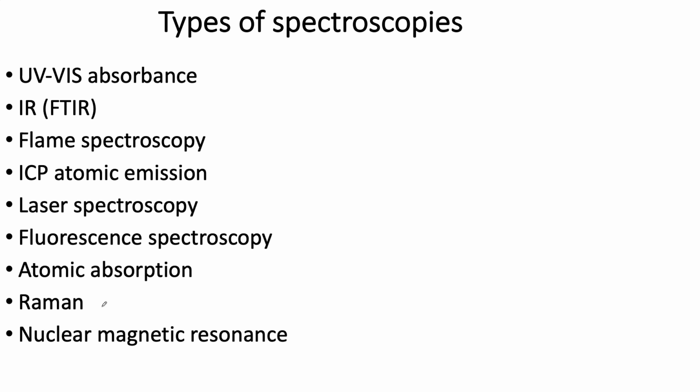There's another one called Raman spectroscopy. In this case, you use a laser. It's almost always an argon ion laser. So you send in light, and you're not looking for that argon ion laser light to come out, because most of the light that comes back out is the same wavelength as the light you put in. Most of it just scatters and comes right back out.